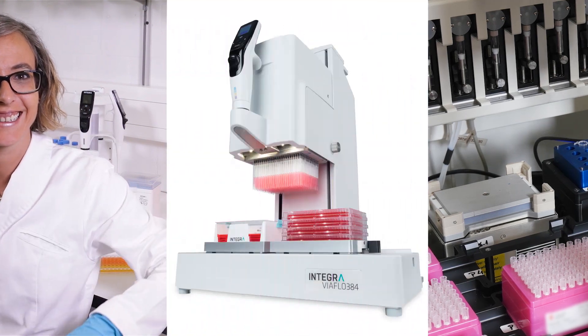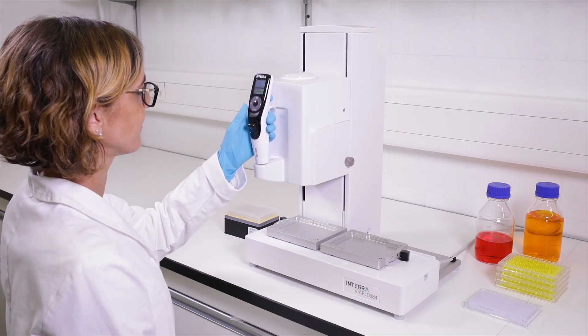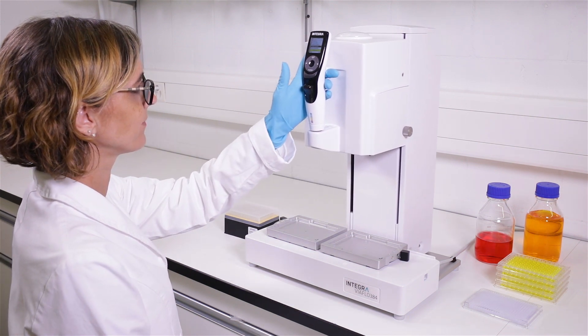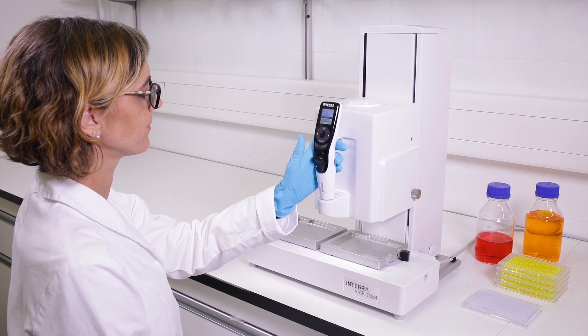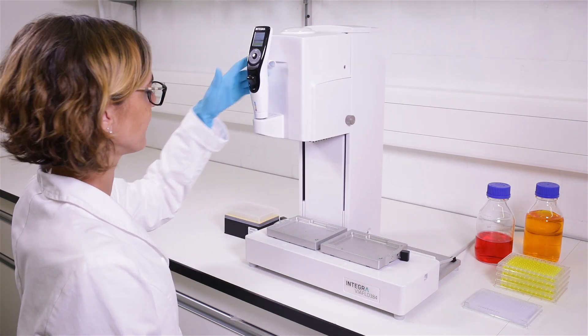Presenting the VIAFLOW 96 and VIAFLOW 384 — a handheld pipette which provides a much higher throughput all while delivering extremely reproducible results. The unique operating concept makes the VIAFLOW 96 and 384 as easy to use as any handheld pipette. It's manually operated, but supported by strong motors for effortless and precise movements.